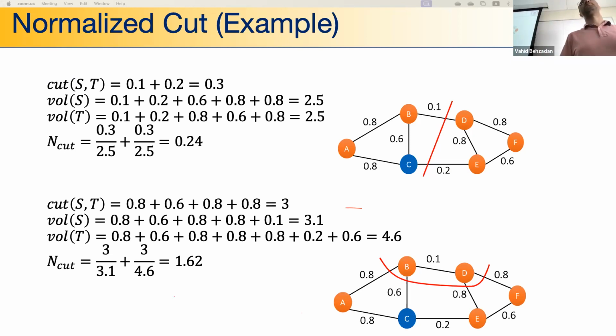So for 0.1 versus 0.3, the lower the value, the farther they are from each other. They don't have the same friends.